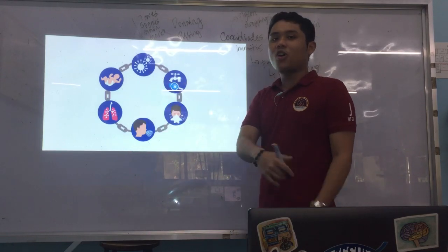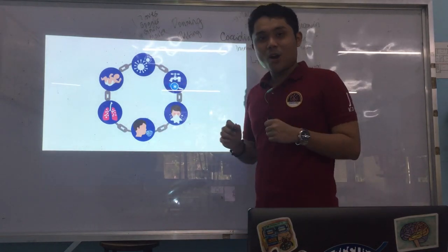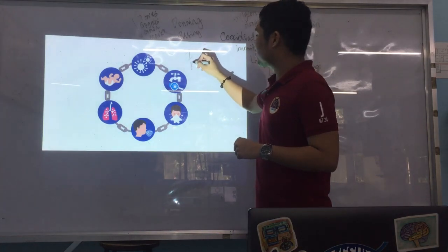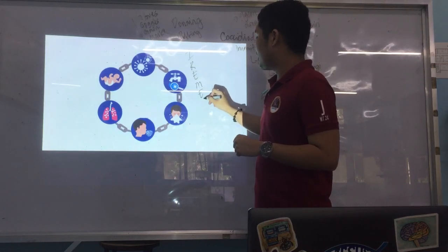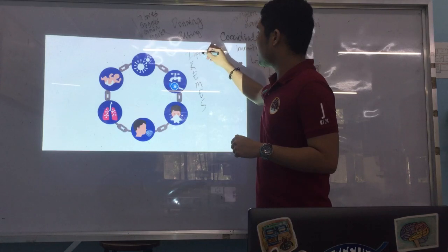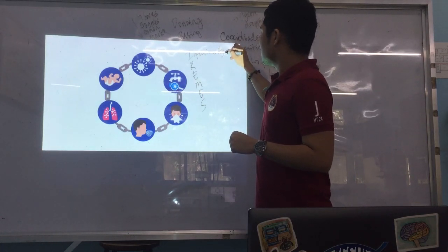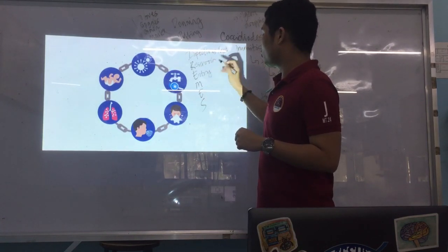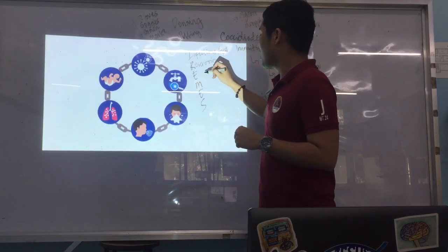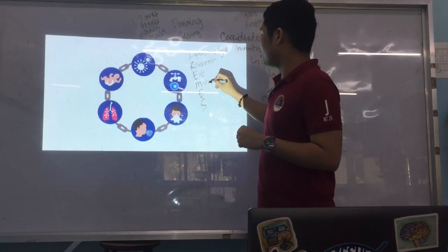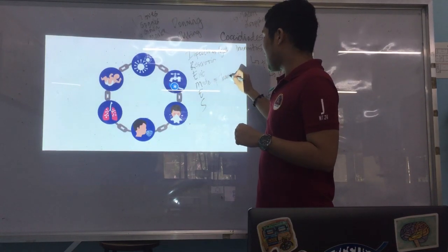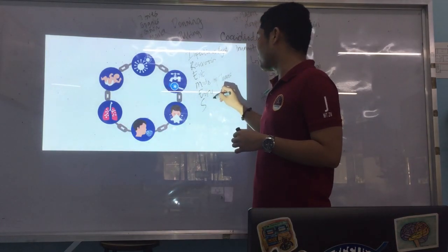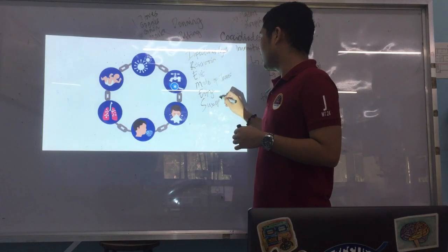Next is the chain of infection, which also appears on board exams. The mnemonic to remember the components is IREMES: I is for infectious agent, R is for reservoir, E is portal of exit, M is mode of transmission, E is portal of entry, and S is susceptible host. The portal of exit and portal of entry can be the same — for example, the mouth, the nose, or the bloodstream.